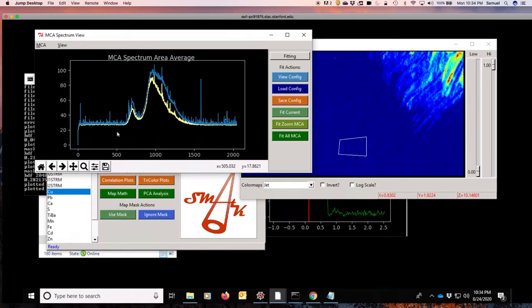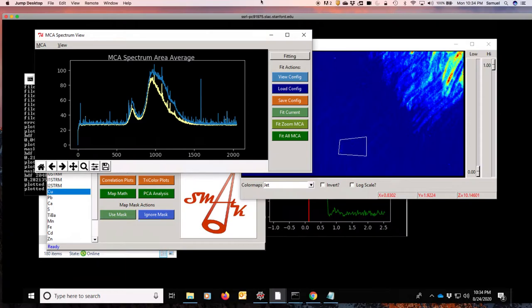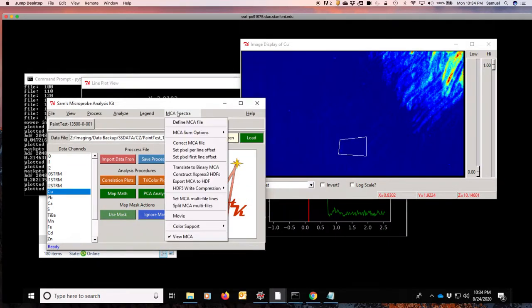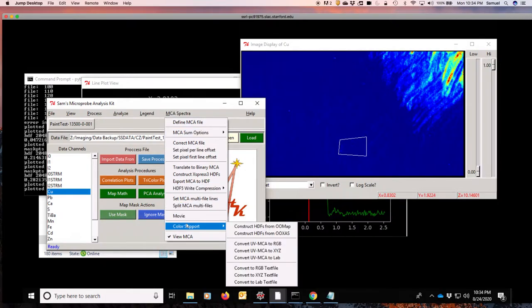It's one thing to be able to look at the UV-visible spectra. These are in units of bin number, which aren't very useful. If you know the calibration curve of the spectrophotometer, we can change this into wavelengths of nanometers. But the program is already calibrated to deal with this. And we can actually convert this into more normal color coordinates.